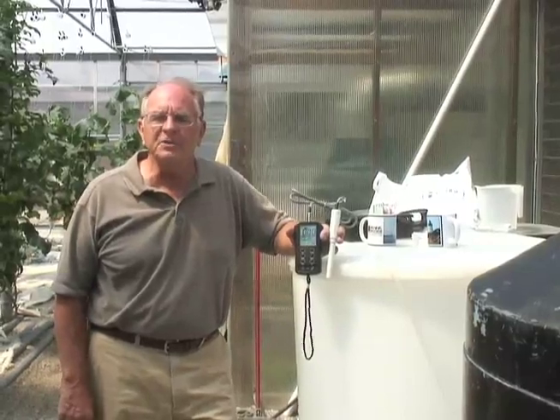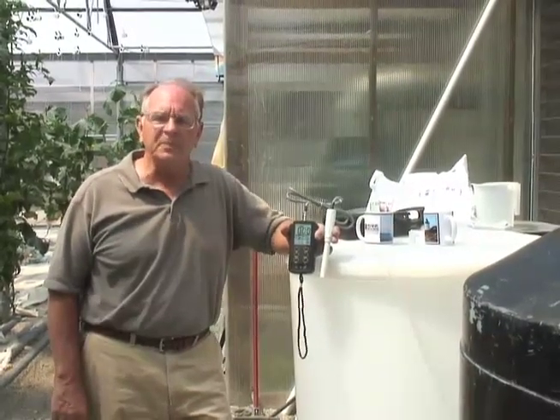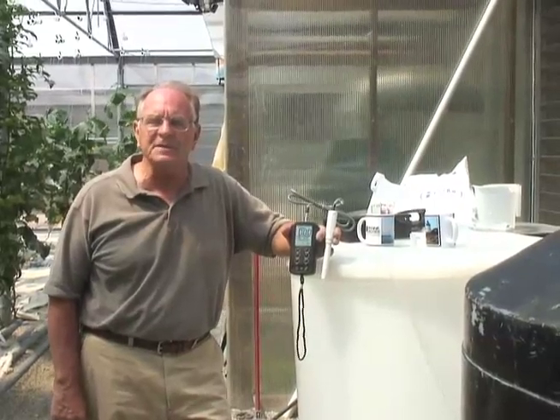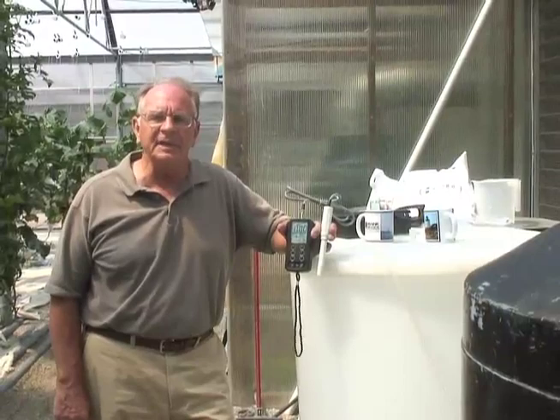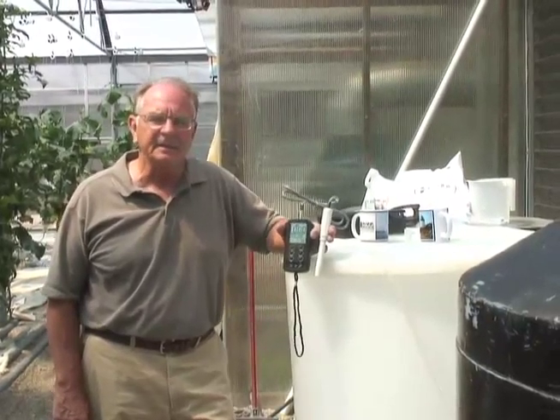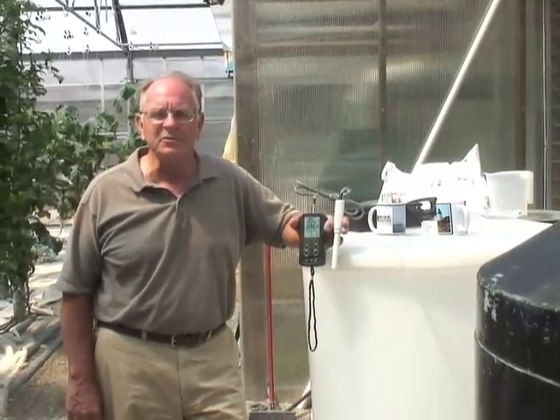We are here at American Hydroponics, Hopkins, Massachusetts, a local hydroponic grower of tomatoes and cucumbers. The demonstration features the Hanna 9813-6N, showing how easy and important this tool is for the hydroponic industry.